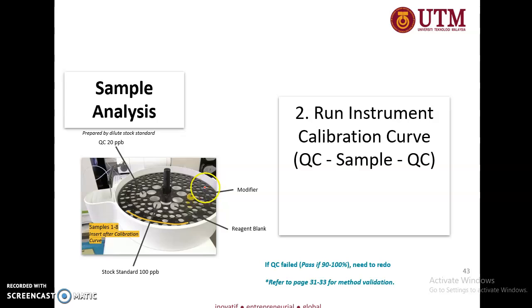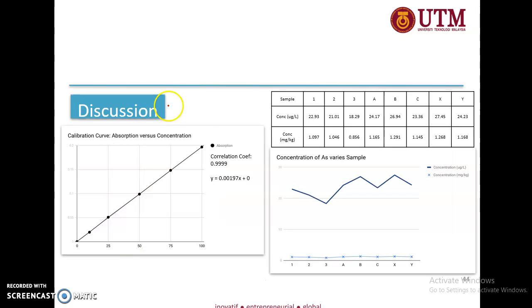You see the tube is smaller because it needs only a small volume. This is the same procedure. You have to do a calibration curve and so on.